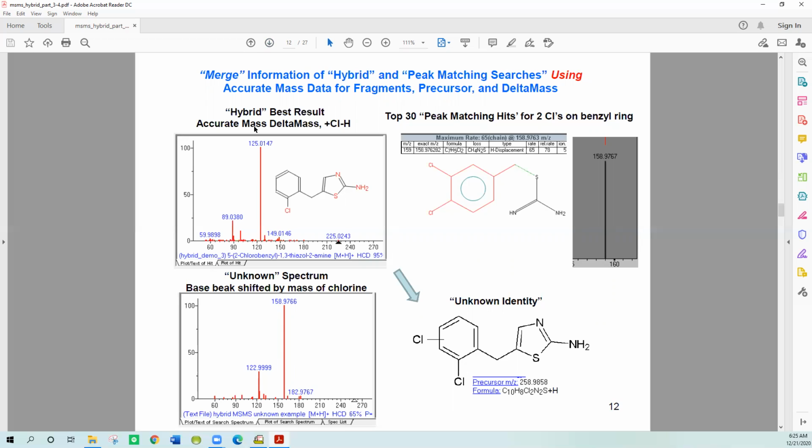And of course, you have all the accurate mass for all of these things also. So when you do the MS Interpreter, if you wanted to look at this, you'll see that everything matches up accurate mass-wise for the proposed structure and substructures.